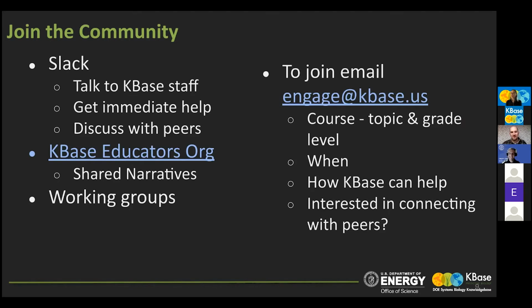But we are working together with more working groups to build out more metabolomics and transcriptomics, so any RNA-seq analysis that you can do within KBase. If you want to join these different groups, or have any questions for us or myself, please send us an email at engage@kbase.us. Submit a request to join the KBase Educators Org. Ask if you can be added to the Slack. Let us know what course you're teaching, the topic and the grade level, when you'll be teaching it, how we can help, and if you're interested in connecting with peers.